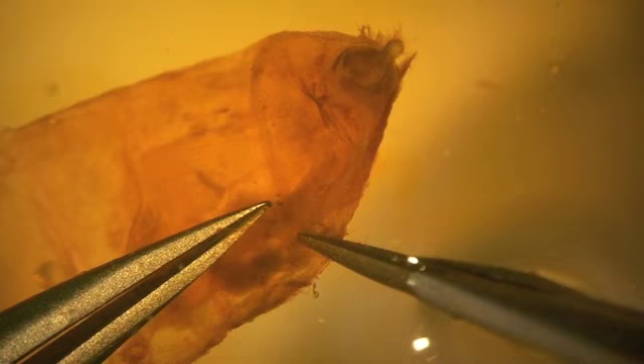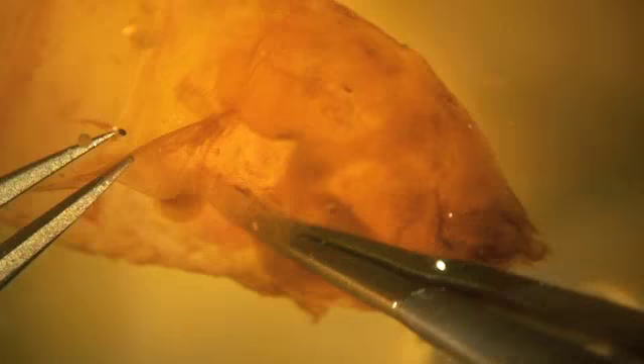At that point, between the seventh and eighth segments, the intersegmental membrane is torn across the sternum and then later torn across the dorsal. After the intersegmental membrane is torn, the genitalia can be removed.